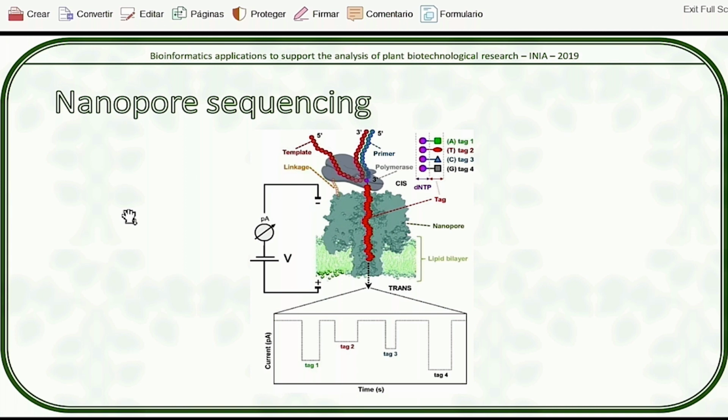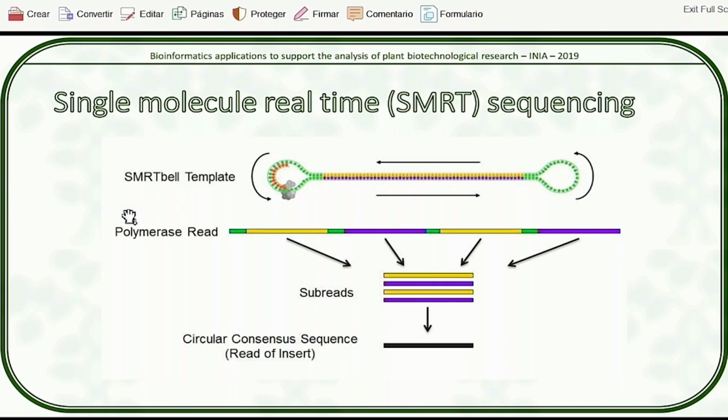That's huge. Now, they try to compensate this the same way they do it with single... well, I forgot to tell you, this also has much worse quality than Illumina sequencing. Whereas with Illumina sequencing you have an average of 1 error every 1,000 base pairs, this one has, in reality, 1 error every 15 base pairs. So it's big. It's a lot of sequencing error.